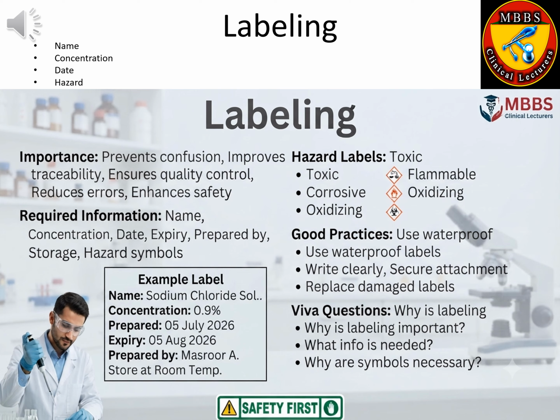Viva questions. Why is labeling important? What information should every label contain? Why are hazard symbols necessary? Key point: a properly labeled solution prevents mistakes, improves safety, and ensures traceability.